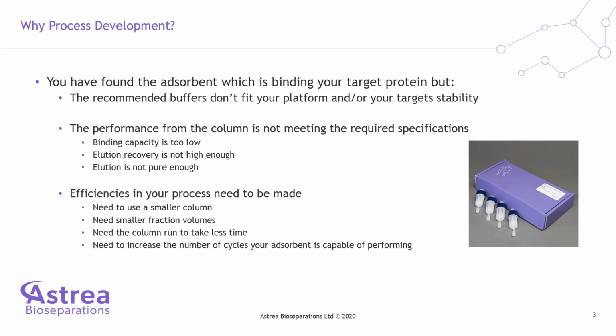Or maybe you want to insert an adsorbent into your platform process, and the loading conditions recommended aren't matching up with the state your feedstock is in. Here you're going to want to see if your feedstock will work with the column as it is, and then if it doesn't, you may need to look at optimizing how you can load your feedstock onto the column with minimal intervention to your feed.